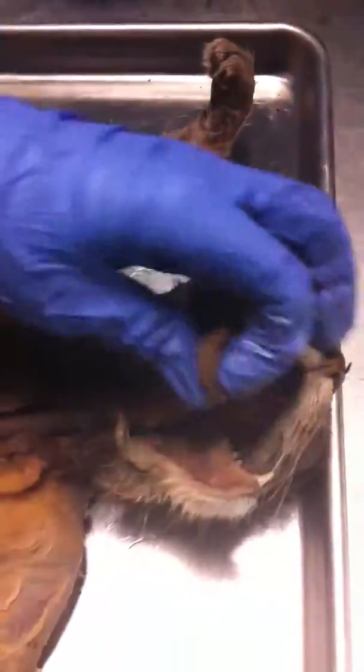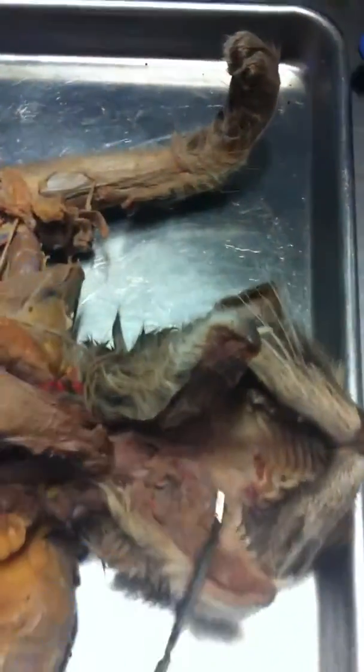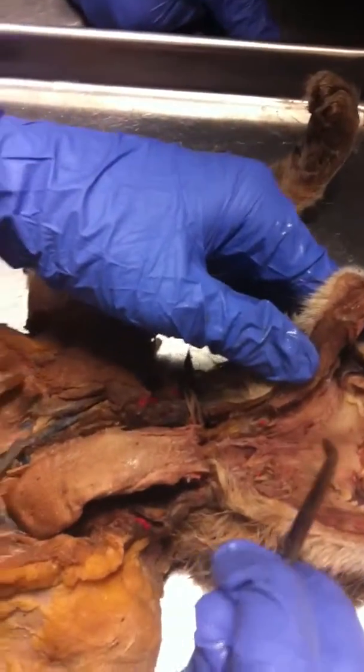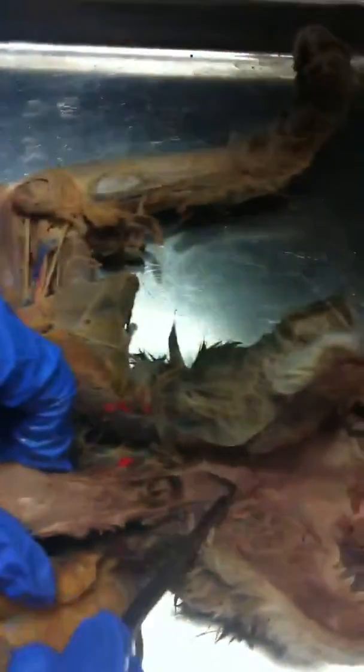Okay. Oral cavity. I guess we're just looking at it right now. Oral cavity would be this top part, top opening. Okay. Hard palate. Hard palate is this top part up here. It goes down to right here, which would be the soft palate. Okay. Pharynx. Pharynx would be this opening here.